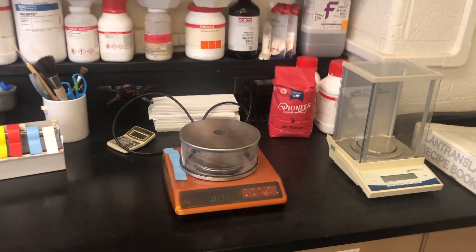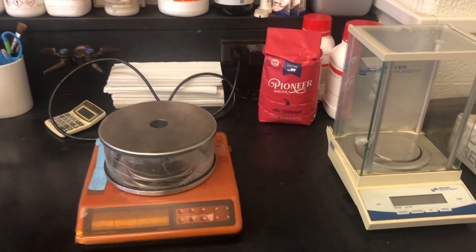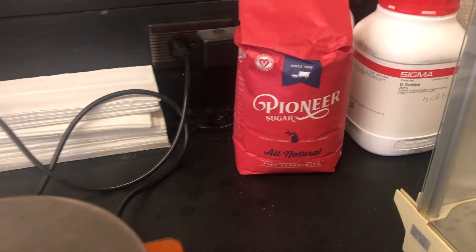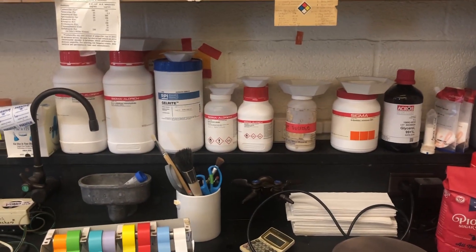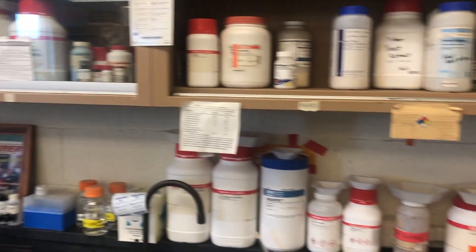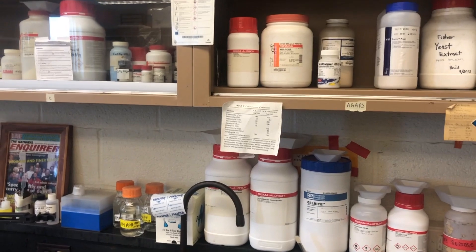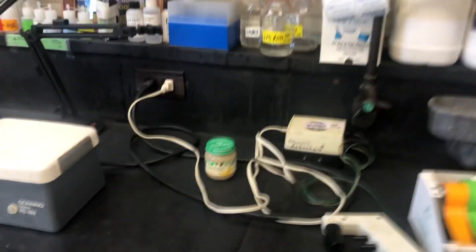So these are the balances here. You can see I even have some sugar — some store-bought sugar. I was comparing store-bought sugar, that's the Pioneer container there, compared to laboratory-grade sugar. But these are all of the chemicals that I have in the laboratory stored at room temperature. There are additional chemicals in the refrigerator, in the freezer, and at room temperature in a desiccator to keep them dry.